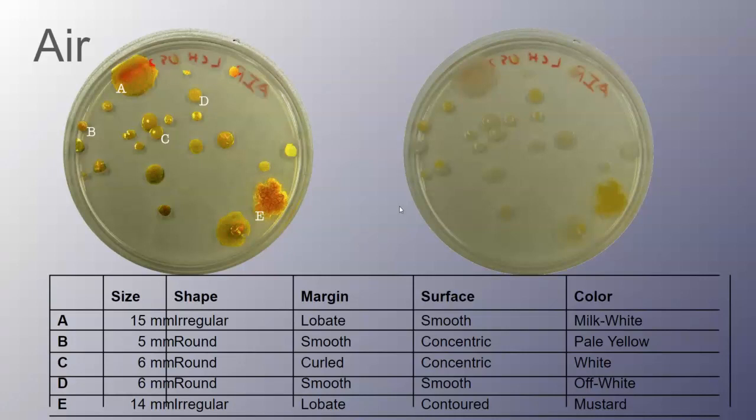A qualitative analysis is to observe these swabs and determine how many different types of bacteria are growing, what do they look like, what's their shape, what's their color, and general information like that.